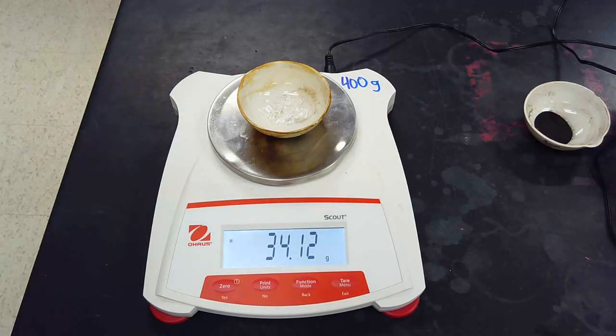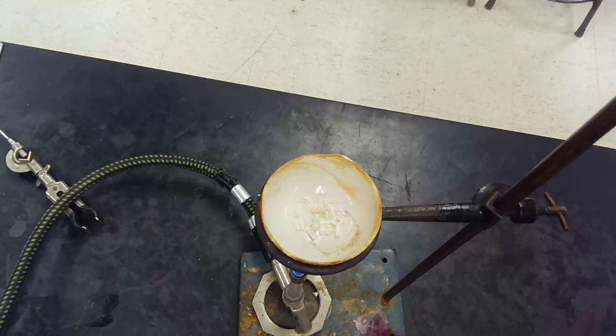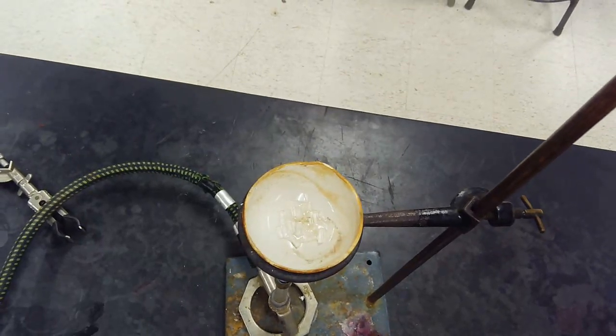All right, we'll walk over to the Bunsen burner. Taking a look — a little bit harder to see because they're clear, but hopefully you can see what's going on in there.